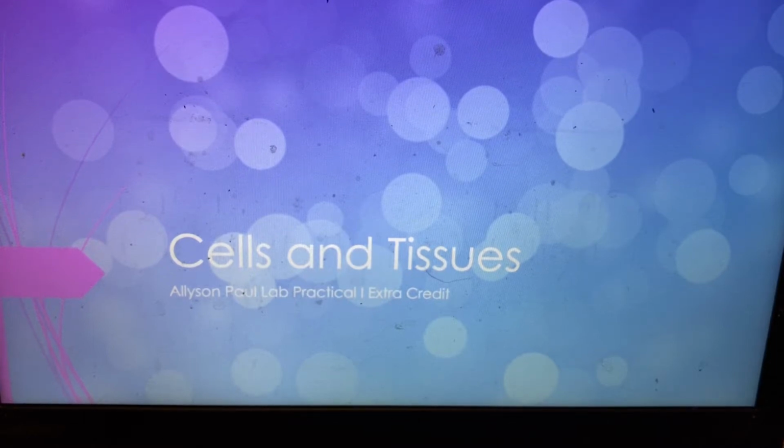Cells and tissues, presented by Allison Paul as a 5-point extra credit for Lab Practical 1.